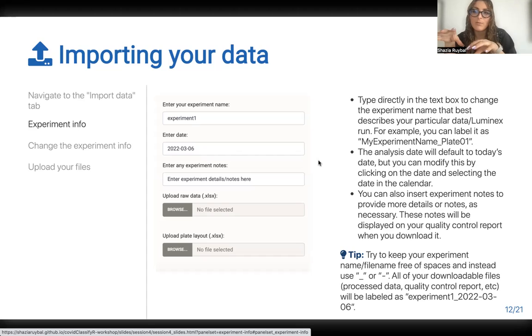It'll still import the information, and whatever you enter will also be included in the report. I think that's a good idea. I'll see if I can have it always print out in the QC report automatically.